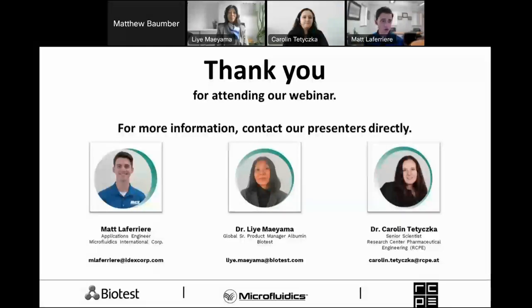So first question that was asked today was, would the microfluidizers be able to be sterile filtered? And the simple answer is yes, absolutely. Microfluidizer processors are regularly able to achieve particle size distributions within any of those required parameters to be able to sterile filter.